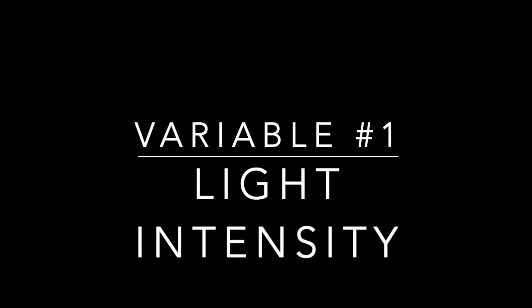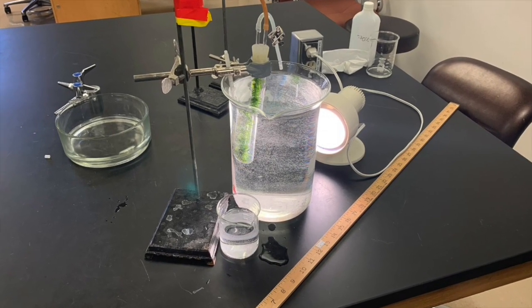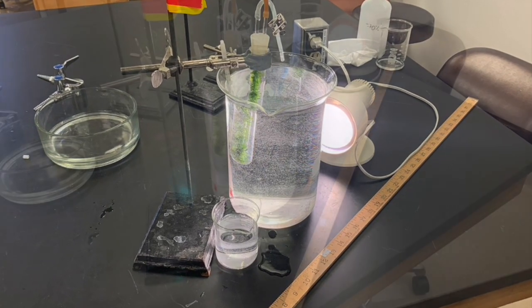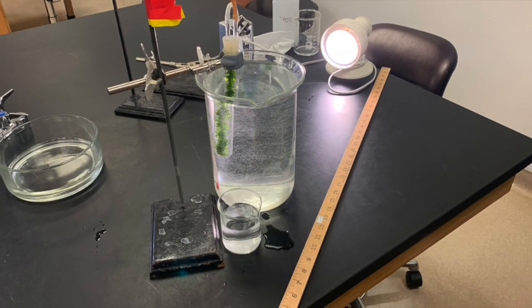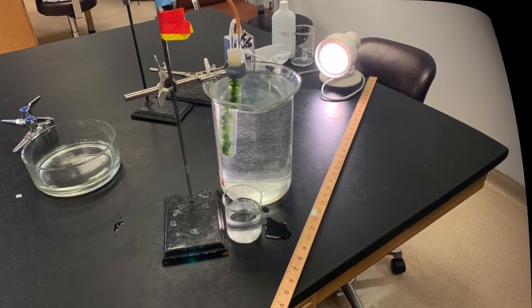The next thing we are going to do is to manipulate different factors and see which factors affect the rate of photosynthesis. So the first variable we will be looking at is light intensity, and we will measure the rate of photosynthesis at high, medium, and low light intensities by positioning our lamp closer to the setup at high intensity and even further away from the setup at medium and low intensities, respectively.